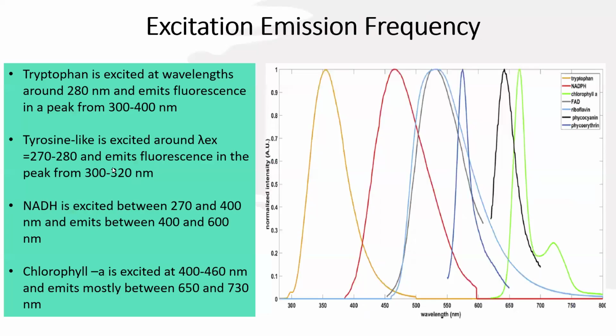Now, the excitation emission matrices obtained from fluorescence spectra can provide a comprehensive picture of the fluorescent properties of various samples and obtain abundant spectral fingerprint information. These fluorescent pigments have specific excitation and emission wavelengths, and the emission and excitation spectra for a given fluorophore are mirror images of each other. Usually, the emission spectrum occurs at a longer wavelength than the excitation spectrum, and these types of spectra are used to observe changes in samples where the intensity and peak wavelength of a spectrum may change based on factors like temperature, pH, or even concentration.